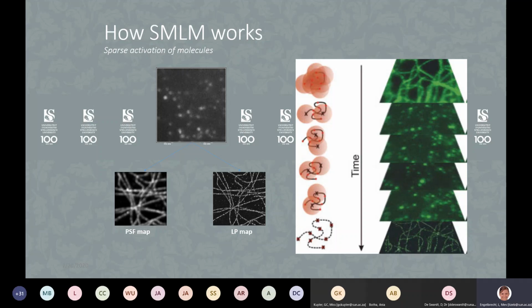So as you can see, single molecule localization mapping depends on a time lapse. You need to do a full time lapse of the blinking to be able to do PALM or STORM. So at this stage, it's something that you need to do only on samples which are really, really stable. You can do it on live samples, but the proteins that you are interested in should really, really be non-moving at all for the duration of your time lapse.